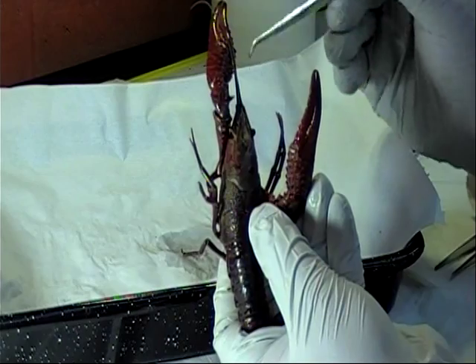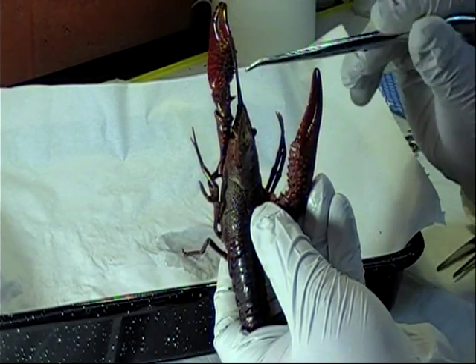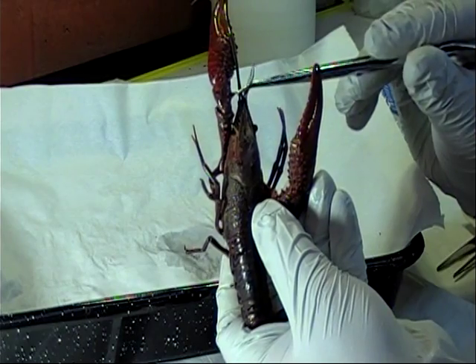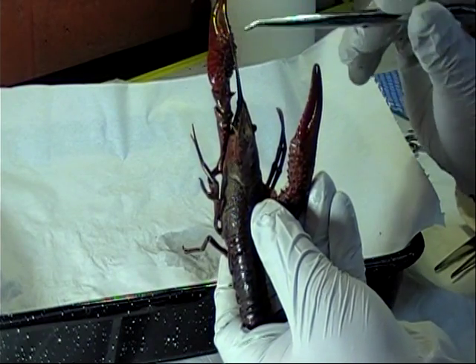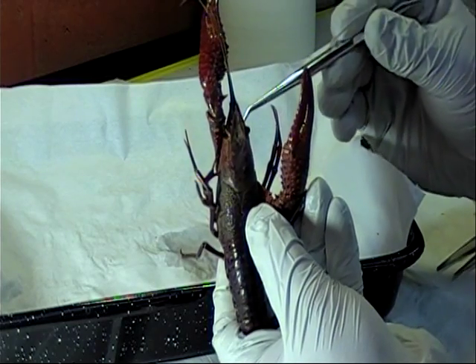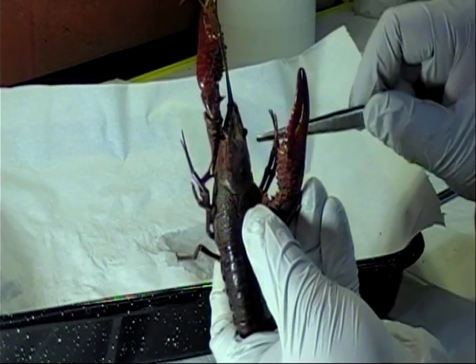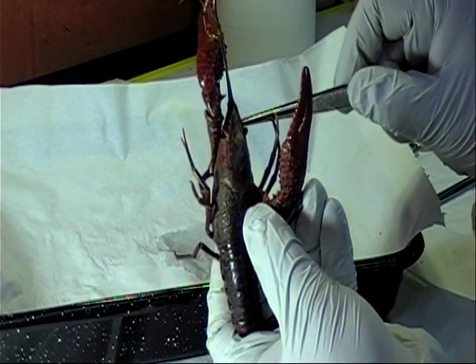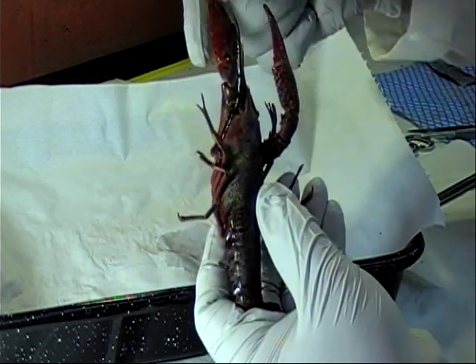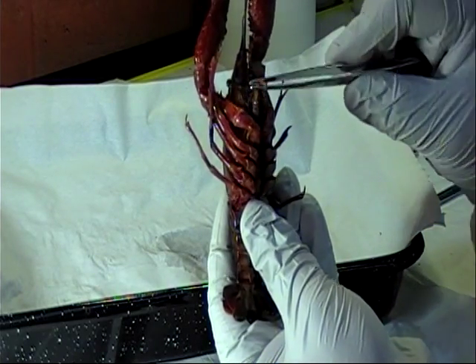We can also see on the head region the antennae and antennules, used for touch, taste, and balance. We can also see the mandibles, which are the jaws of the crayfish, and the maxillae, which are used for holding and tearing food and passing it to the mouth.